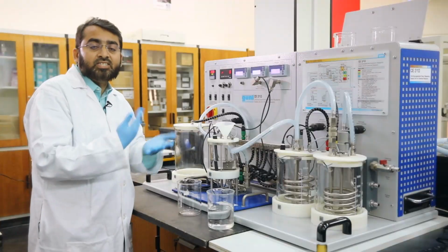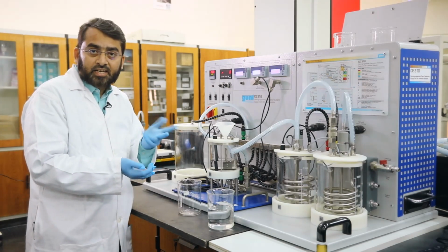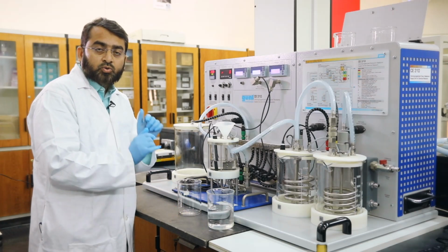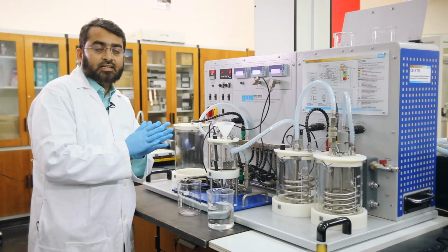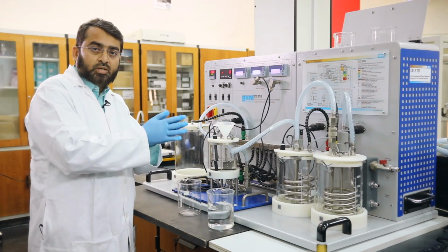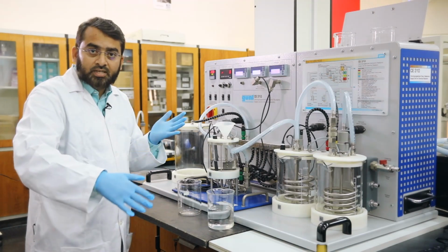From there, the reaction starts, and you will see that conductivity is decreasing because of the reaction. Sodium hydroxide is being consumed and you are getting sodium acetate, which is also conductive, but its conductivity is much less than sodium hydroxide. So with the reaction, you will see that conductivity decreases with time.